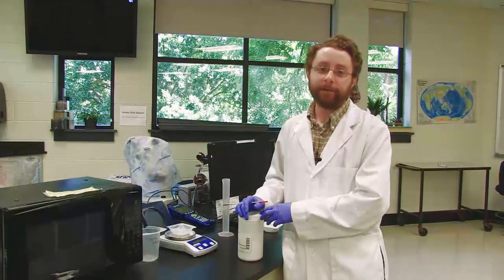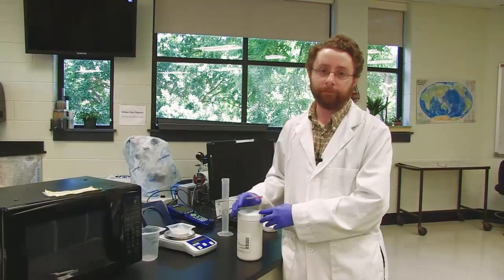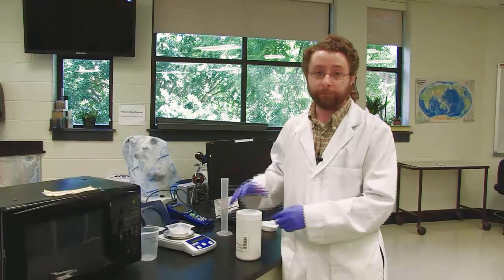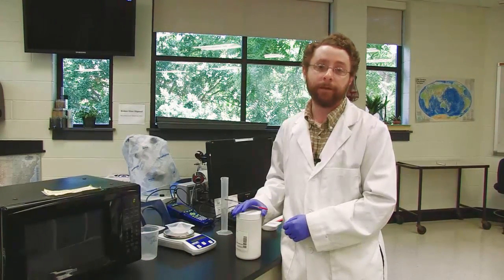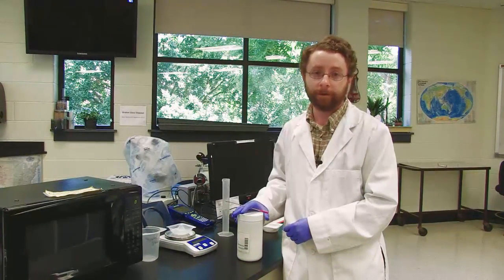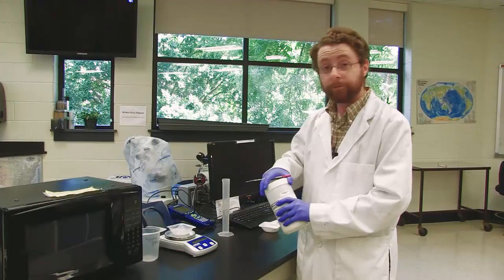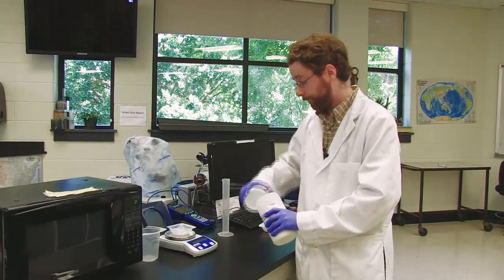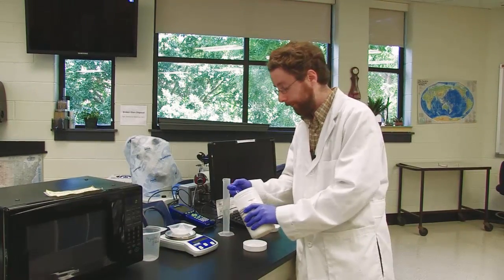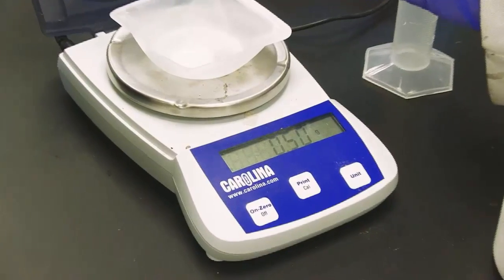So to begin making our agarose gel for DNA gel electrophoresis, we begin by measuring out our agarose. And as we saw in the calculation, to make a 50 mil gel, I'm going to need 0.5 grams of agarose. So I have my scale here and my weight boat. So using a spatula, I will measure out 0.5 grams of agarose.